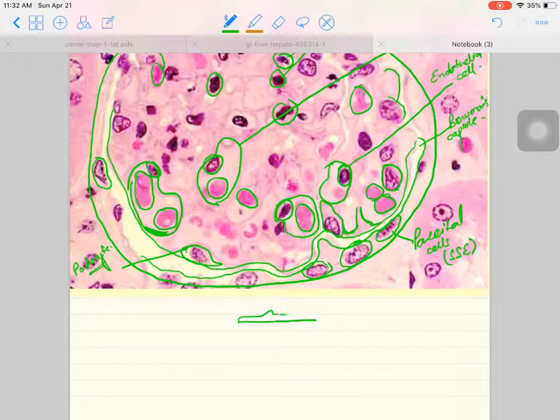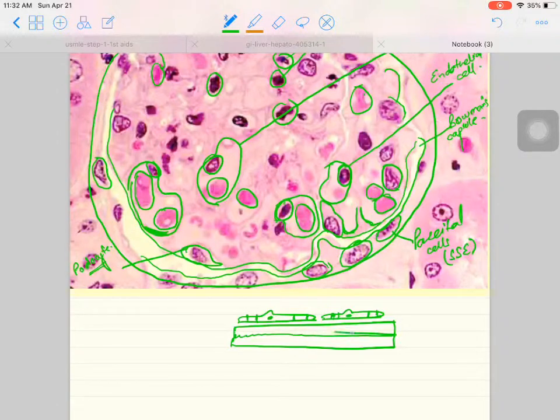There is a fenestrated capillary network, fenestrated capillaries lining the endothelium. They have fenestrations, pores, which provide significant filtration. Below this we have the glomerular basement membrane, with the lamina rara and lamina densa, made up of connective collagen fiber. And then we have the special podocytes.